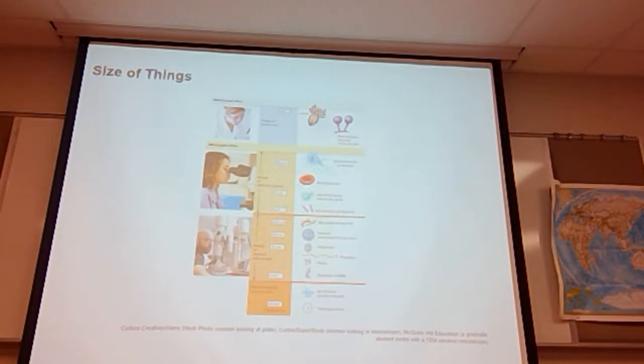Microscopic views. There's a red blood cell. There's Giardia lamblia. It's a protozoa and causes a condition called giardiasis, interestingly enough. Saccharomyces cerevisiae, that's the typical yeast. That's baker's yeast there. Escherichia coli, that's a bacteria. And you see you've got all of these things ranging in the micrometer field.